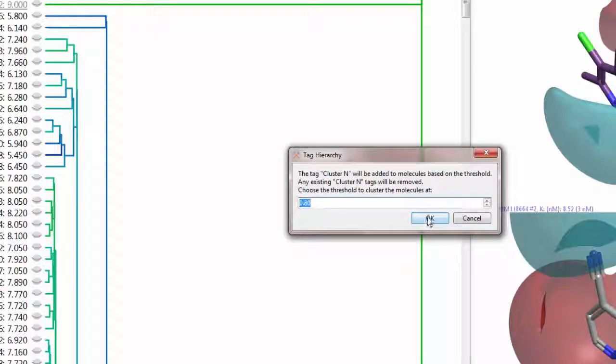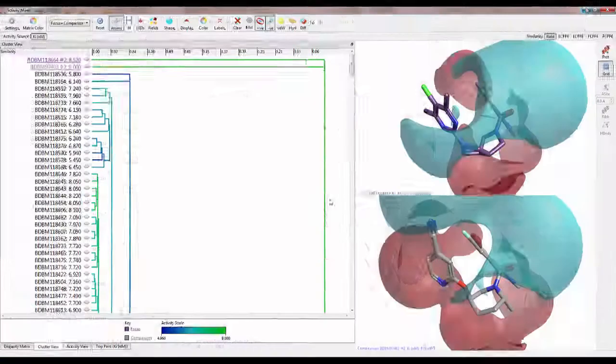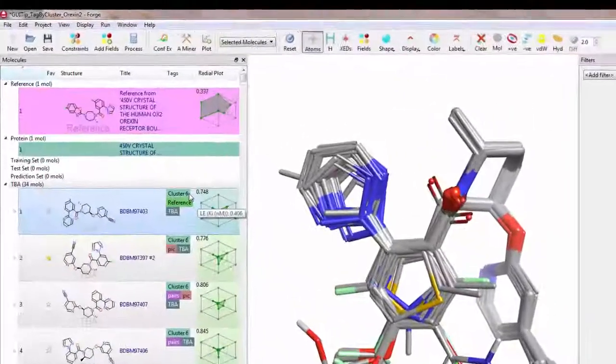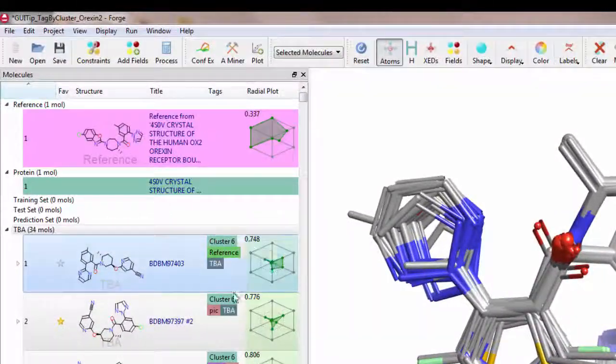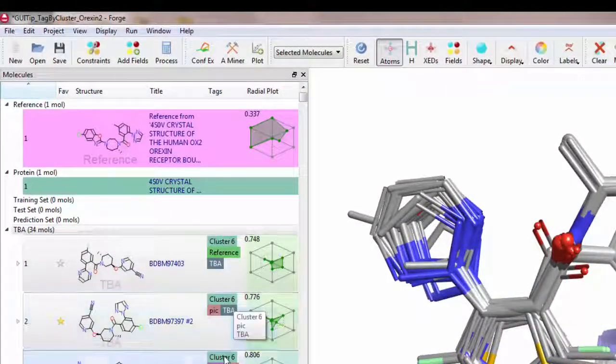Back in the main FORGE interface, in the tags column in the molecules table, the cluster number is written.